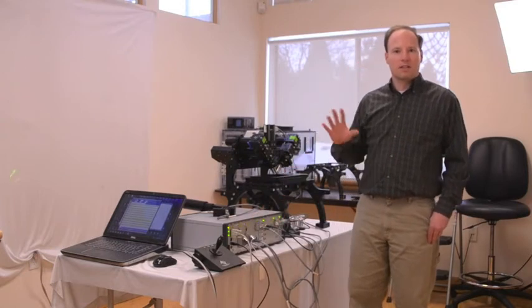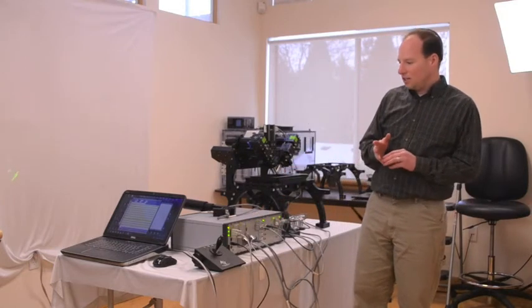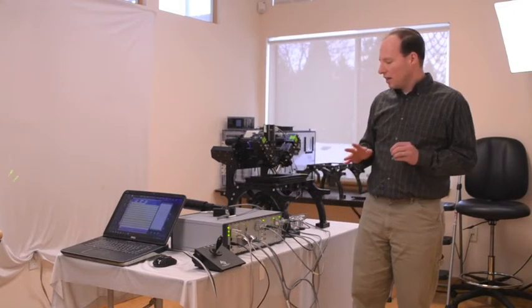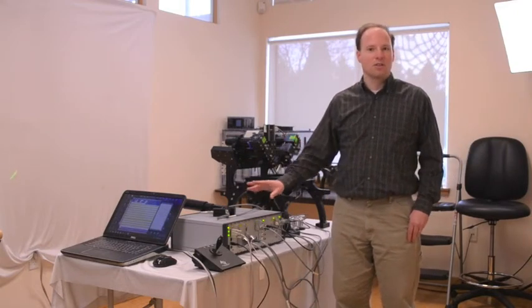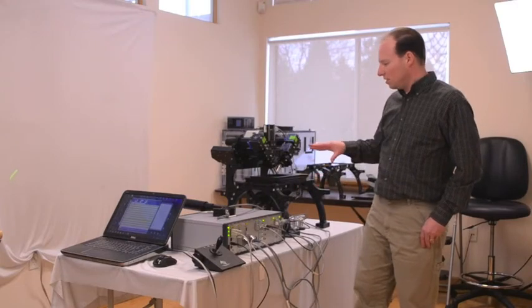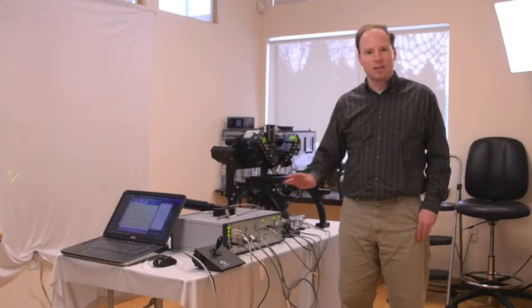So the user simply has to specify how many light sheets, the camera frame rate, things like that, and then tells the controller to go, and the light sheet operation is taken care of automatically by the controller.